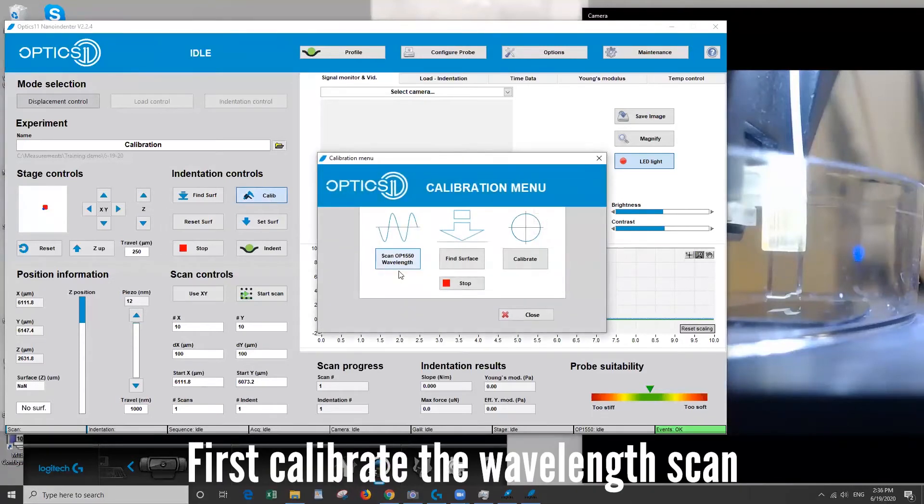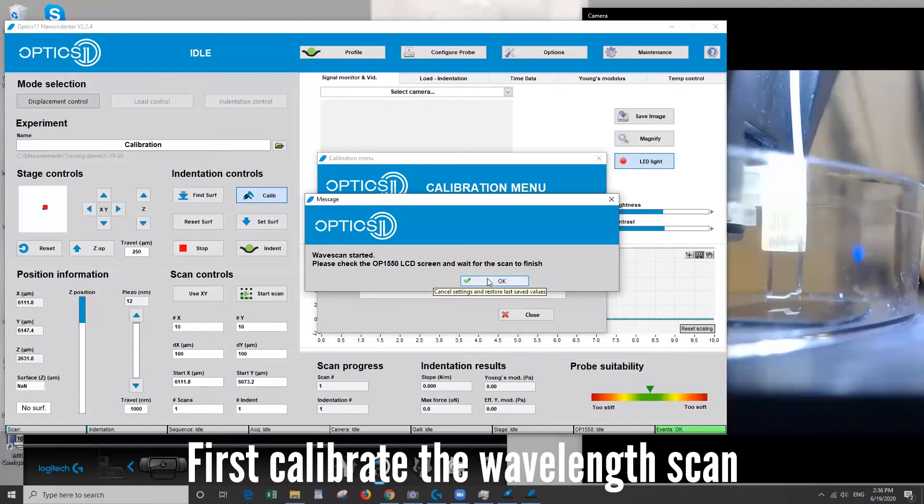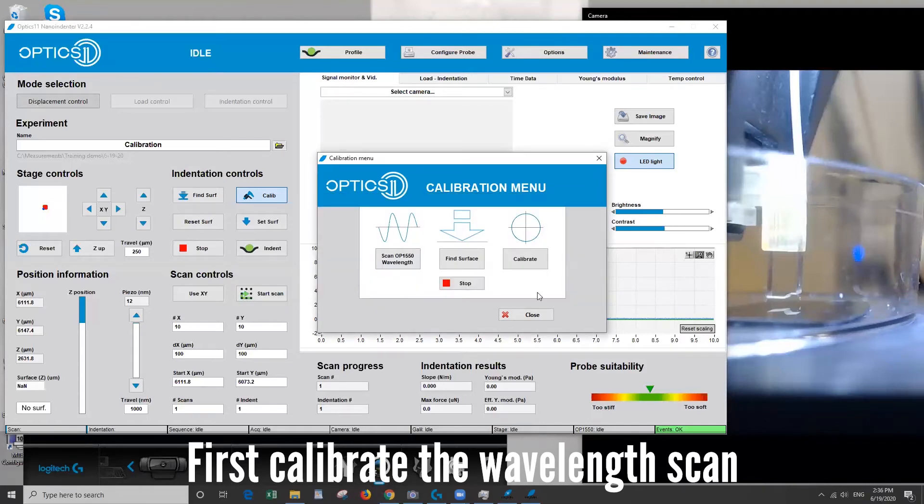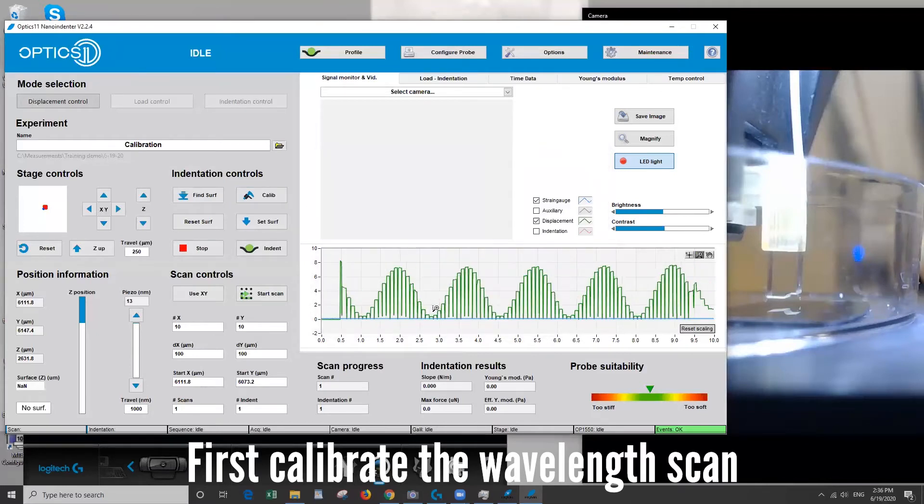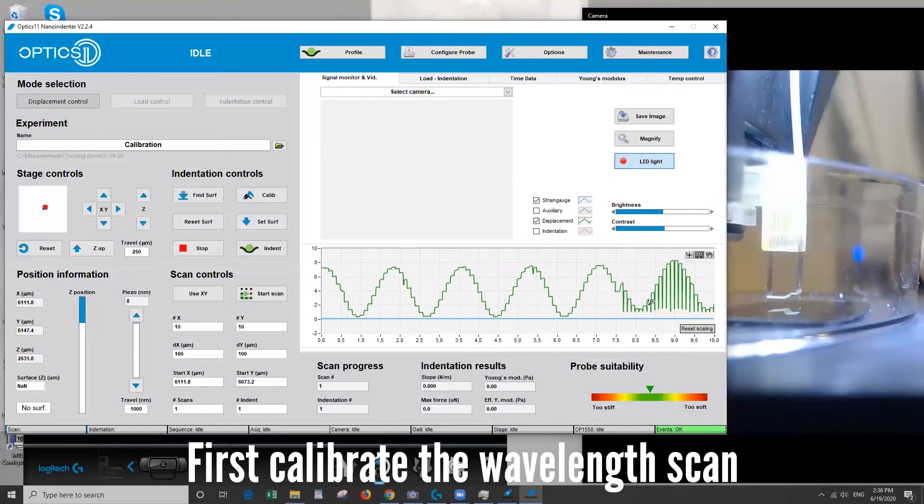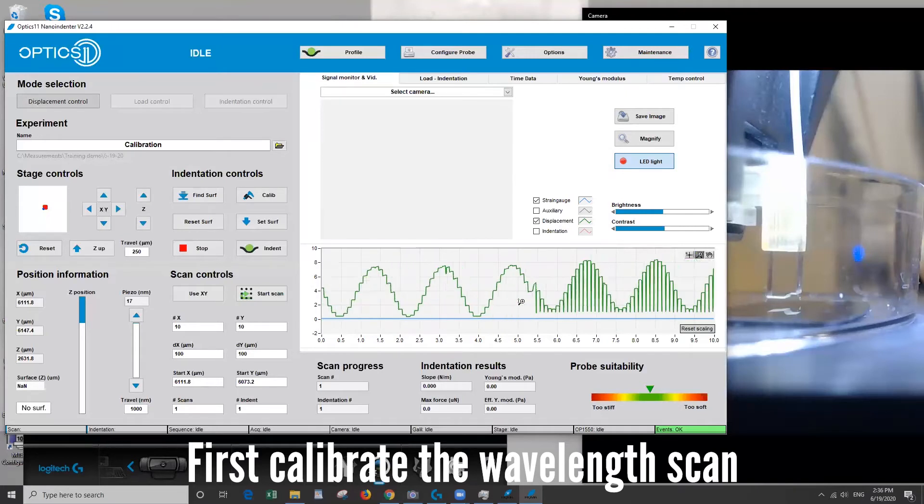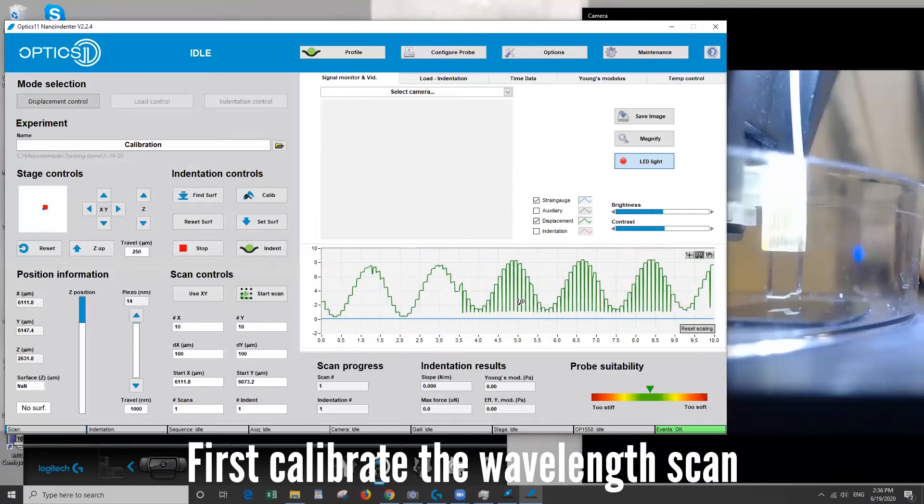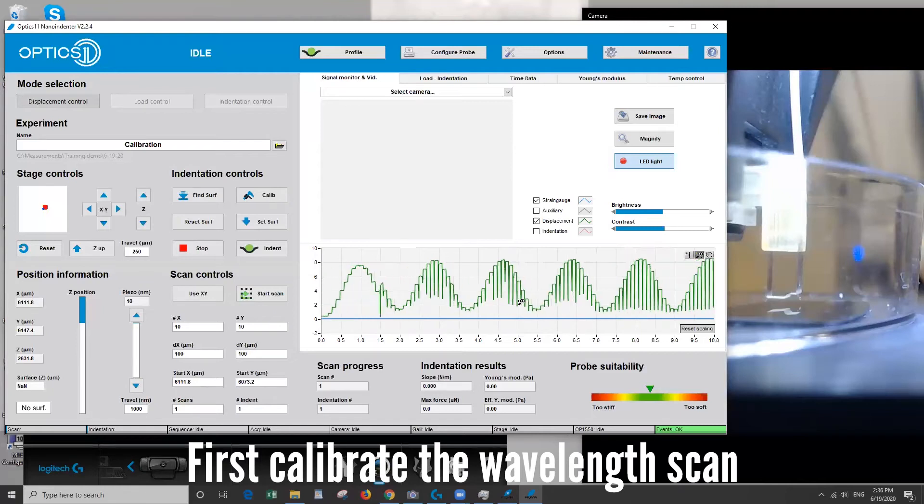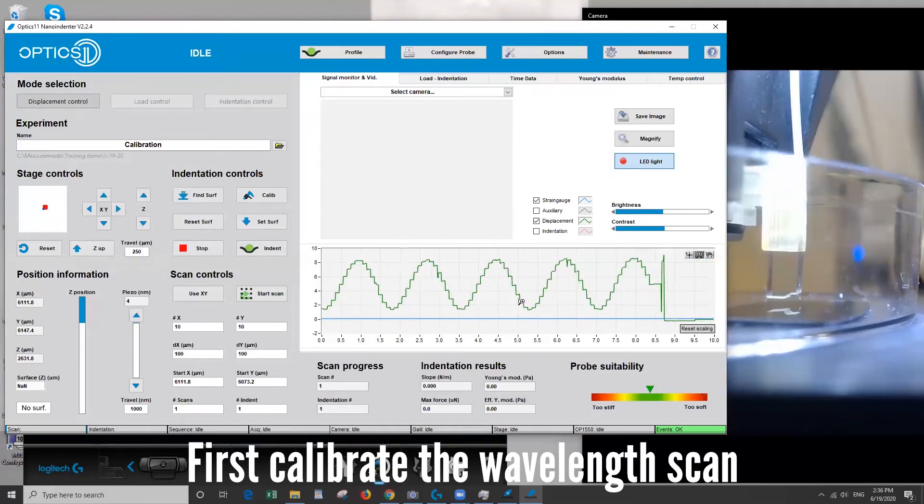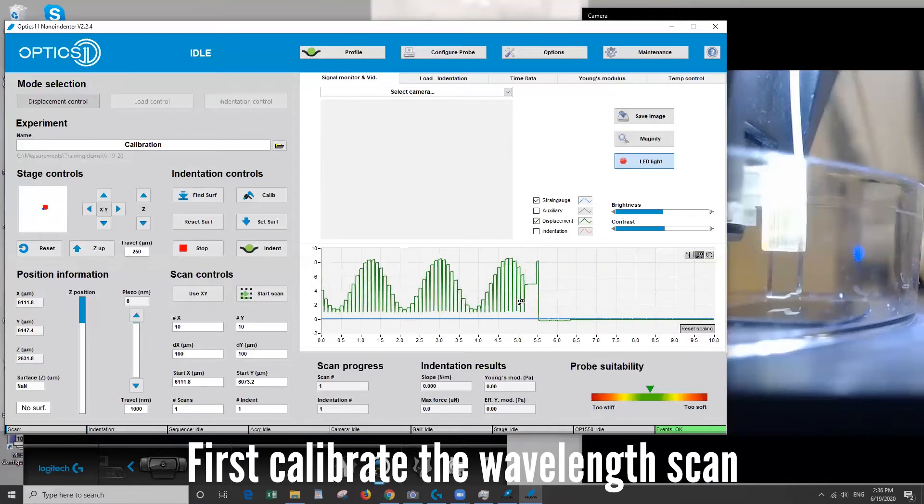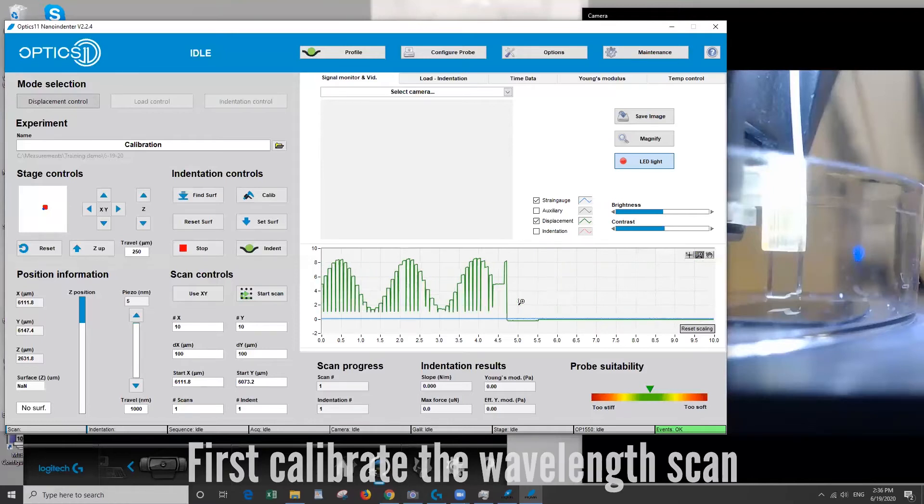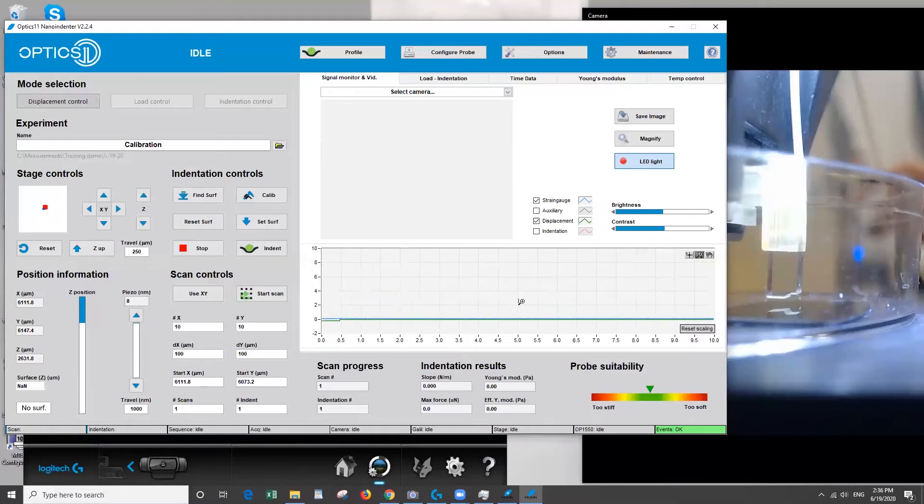The button that we're interested in now is this calibration. So what we're going to do is perform a wavelength scan. We want to calibrate the signal coming through the fiber optic before we begin any indentations and this has to be done in the same medium that you're going to be performing the experiment in. And you can see the signal here. Okay it's finished and everything looks good.